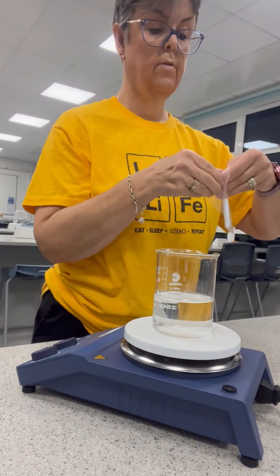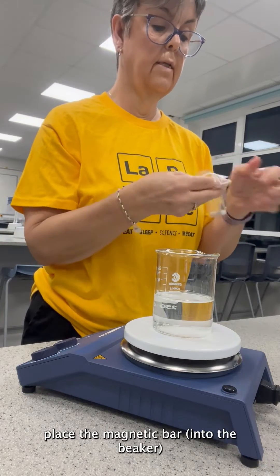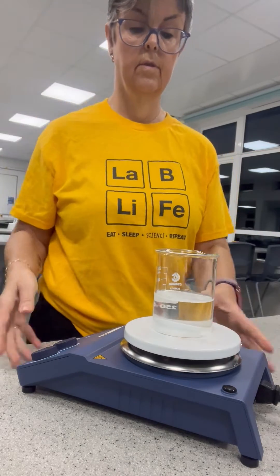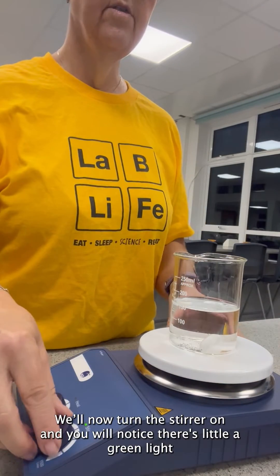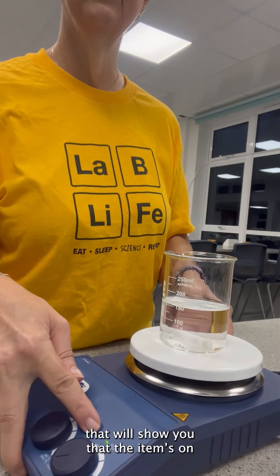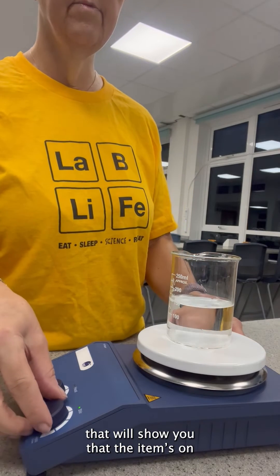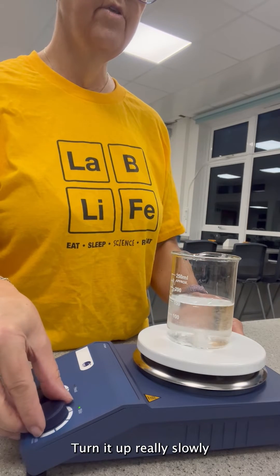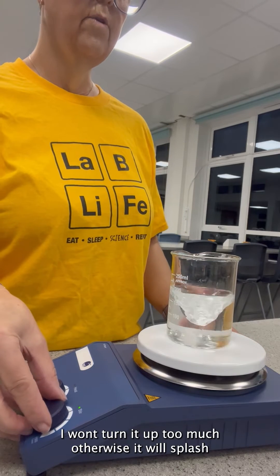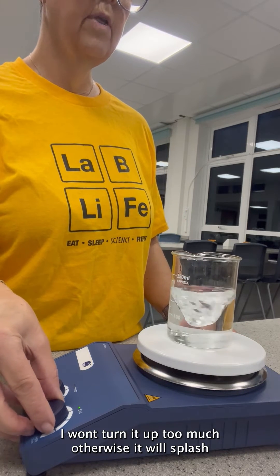Now I am going to place the magnetic bar into it — there's a clunk. We will now turn the stirrer on, and you will notice there is a little green light that will show you that the unit is on. Turn it up really slowly, as it won't turn too much because it will splash.